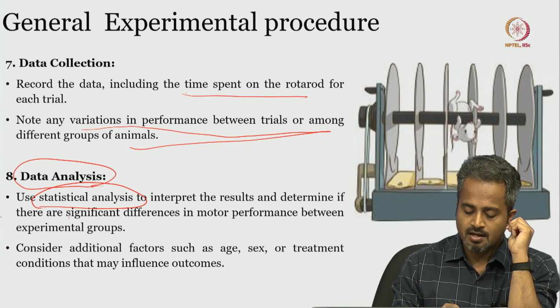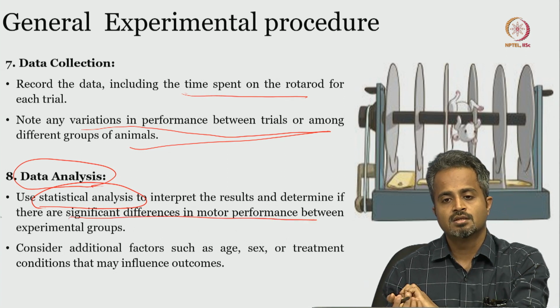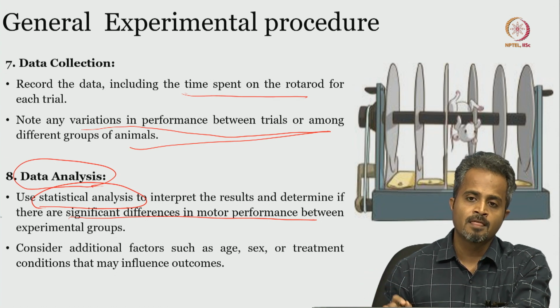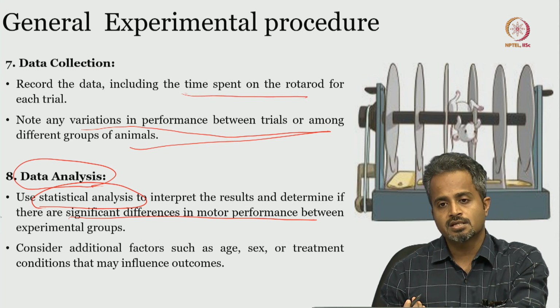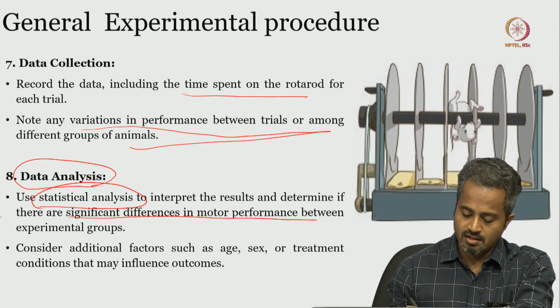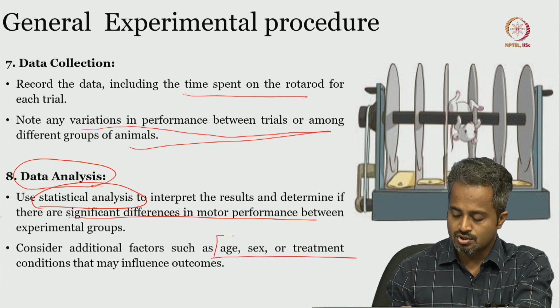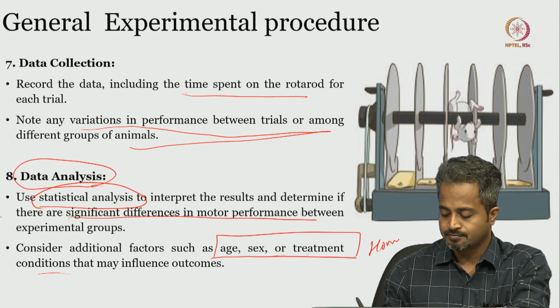Because there can be significant differences between the experimental groups, there should not be any false negatives or false positives interfering with the ultimate interpretation of the data. Definitely there are additional factors, as I said, for the stroke model, that you should consider: age, sex, or the treatment condition should be homogeneous.